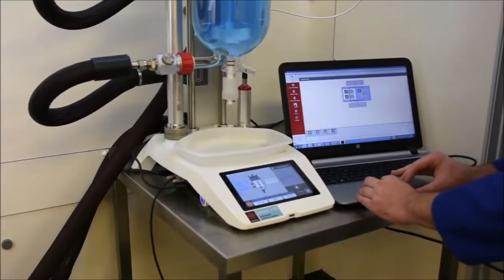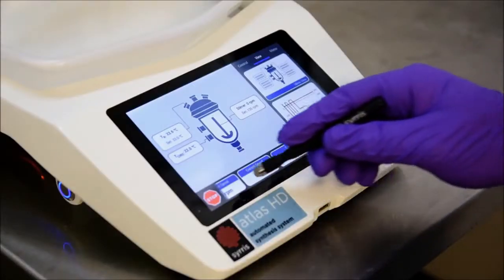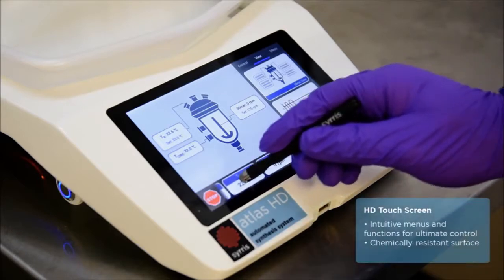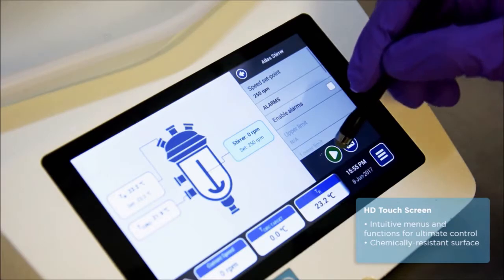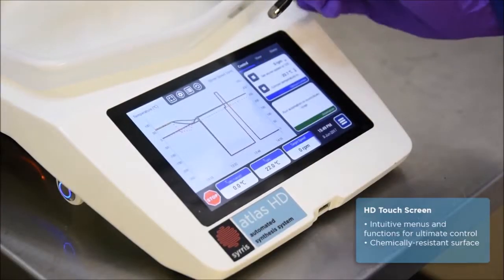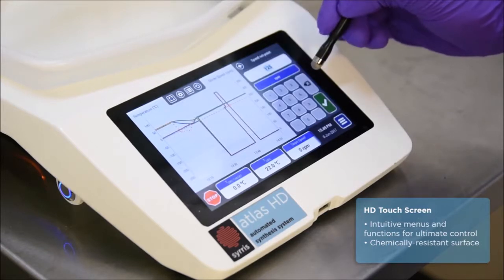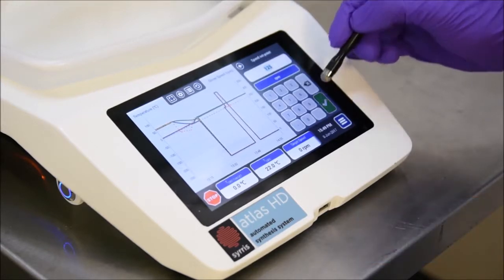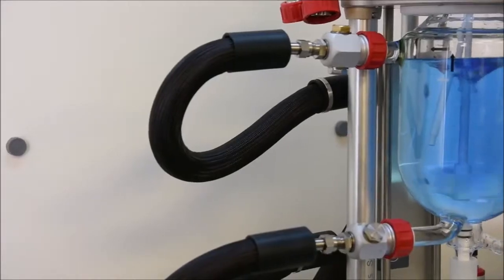One of Atlas HD's crowning features is the built-in touchscreen in the base, offering ultimate control and flexibility over experimental parameters such as temperature and stirring speed, and quick configuration and automation of circulators, stirrers, probes, and Atlas pumps. The screen enables automated process data capture to USB drives and real-time graphic display of data, while PC software control provides ultimate third-party device integration and automation.